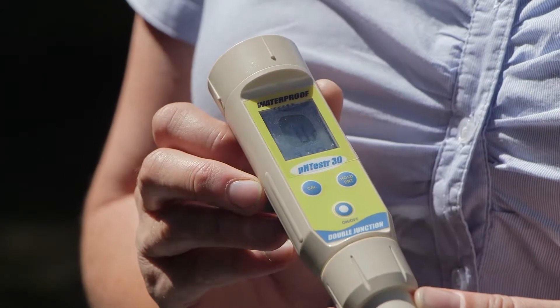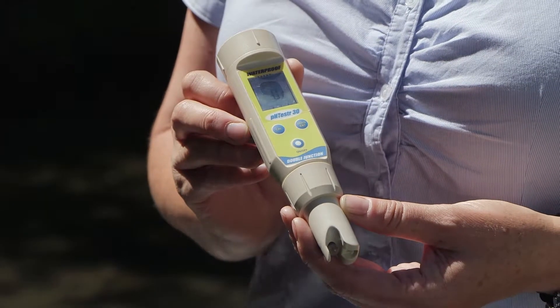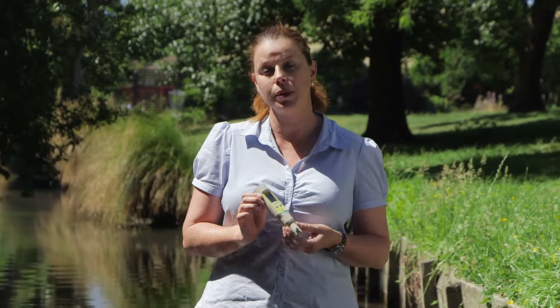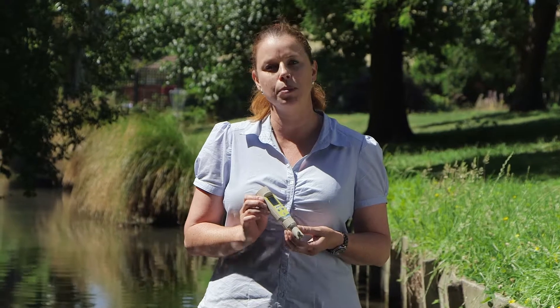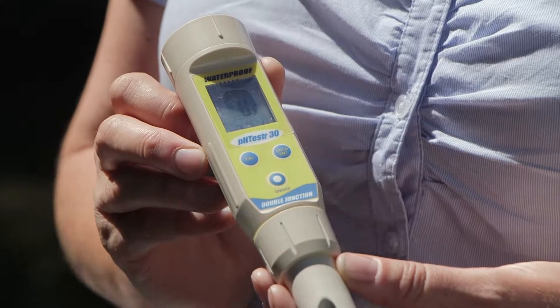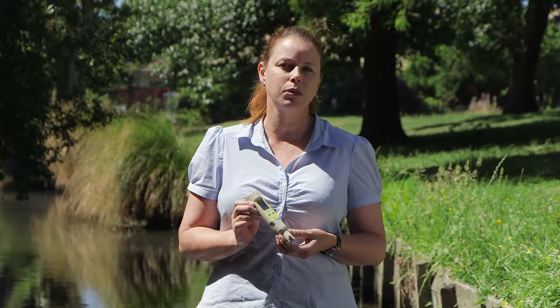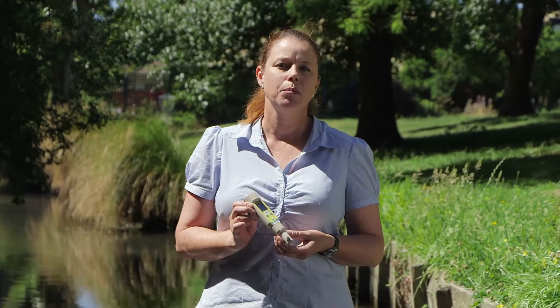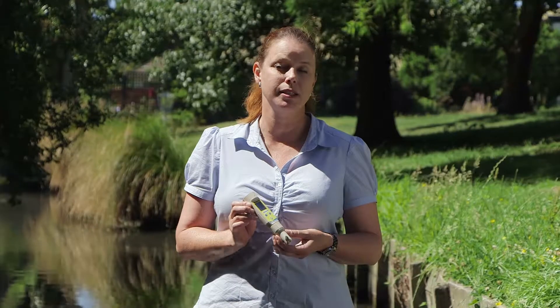This is a pH meter. There are a number of limitations you need to be aware of when using a meter. They need to be regularly calibrated at least once a month. They do degrade over time so you will need to replace them, and they can also take quite a while to stabilize when you're taking a pH measurement. This can sometimes limit their use, but they are very good to get a quick and easy idea of what's going on with your pH. If you need more information, you should be taking a sample and getting it tested at the laboratory.